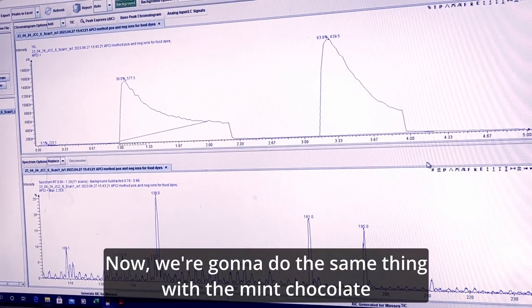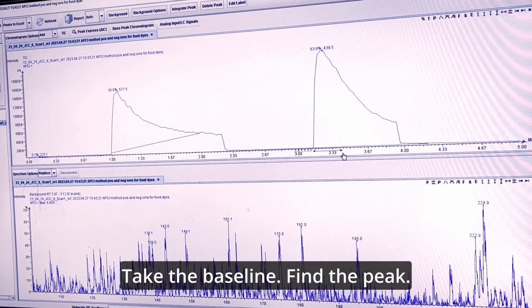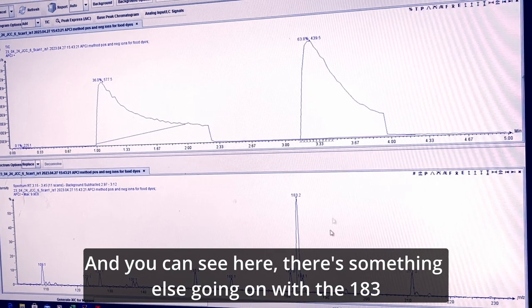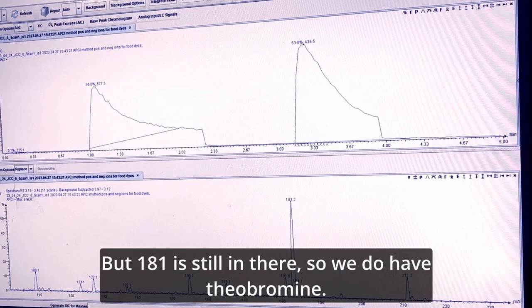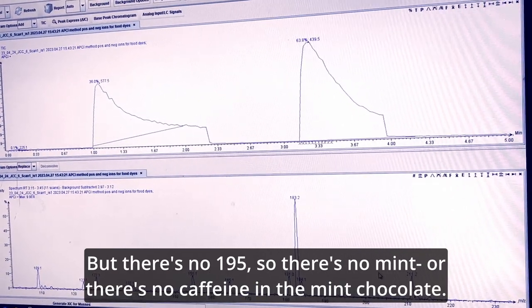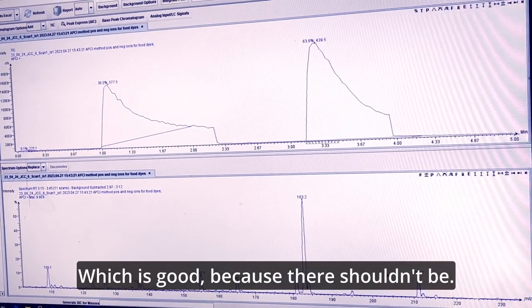Now we're going to do the same thing with the mint chocolate. Take the baseline, find the peak, and you can see here there's something else going on with the 183, but 181 is still in there. So we do have theobromine, but there's no 195. So there's no caffeine in the mint chocolate, which is good because there shouldn't be.